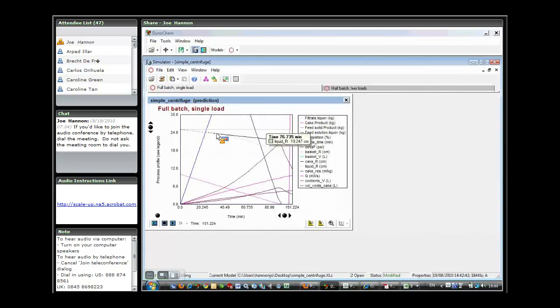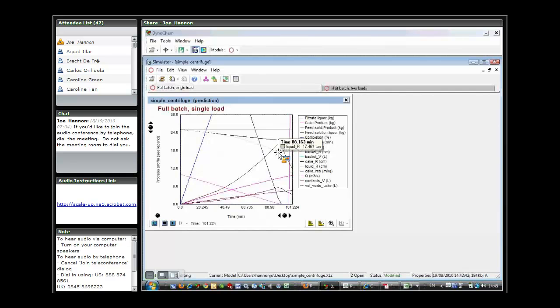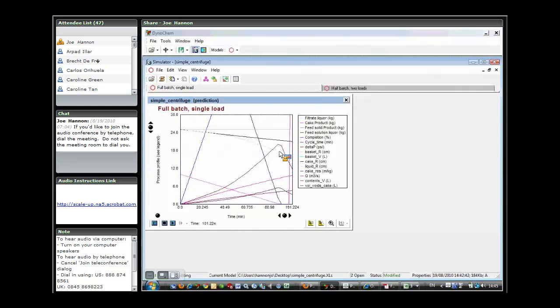The liquid is always above the cake, and then as the resistance in the cake builds up, it takes more liquid on top of the cake to push the liquid through the cake, so the liquid is continually building up on top of the cake. But in this case, we can see that there's no problem in charging the entire quantity of material in 90 minutes, and we don't fill the basket.